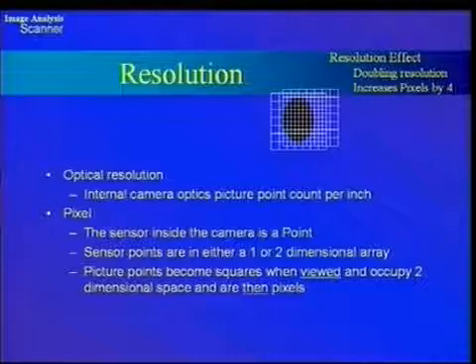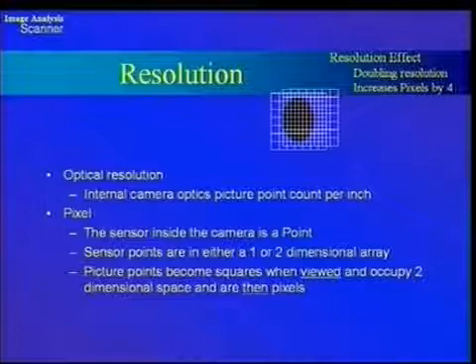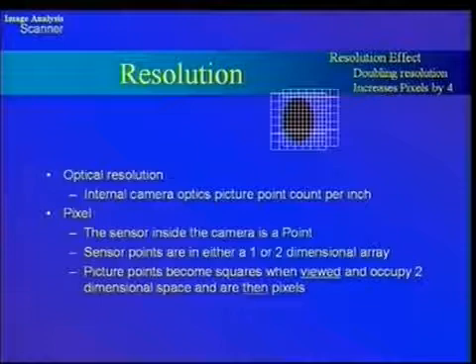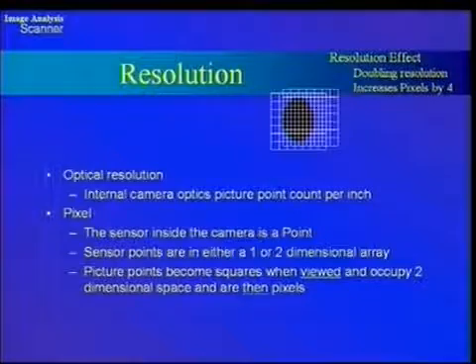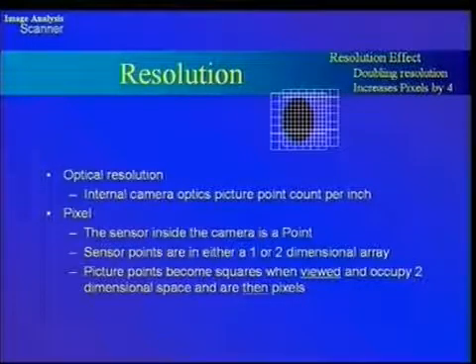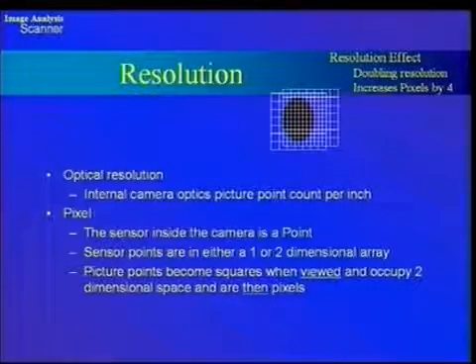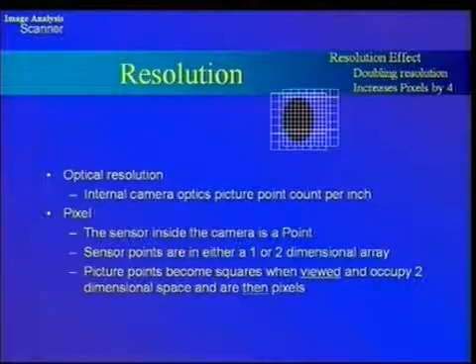Resolution is very important. Most of our specs are very small. We're looking at specs of 0.01 square millimeters. To acquire the image of such a small spec, you require a resolution of at least 600 ppi. Moving to higher resolution of 1200 and 2400 ppi, we increase our ability and our accuracy of the measurement considerably. In production, though, we found that 600 ppi is adequate.